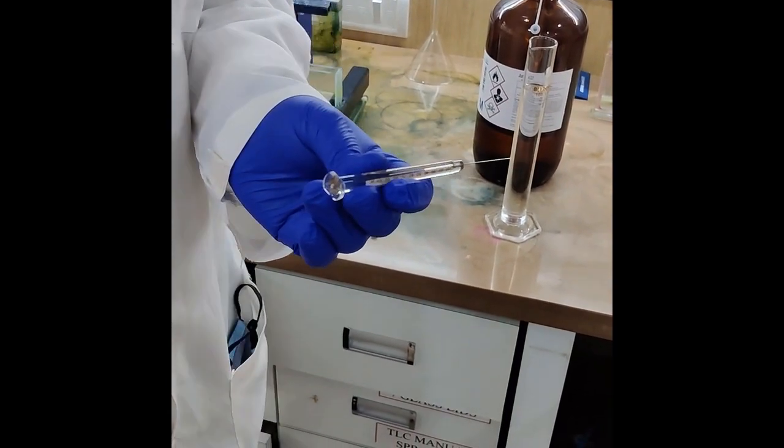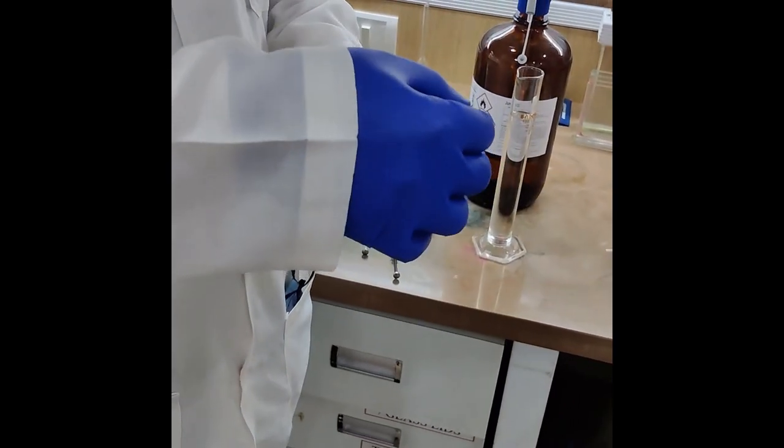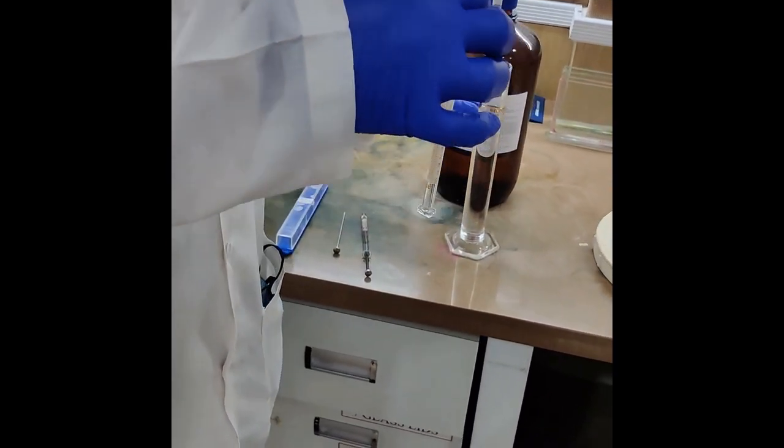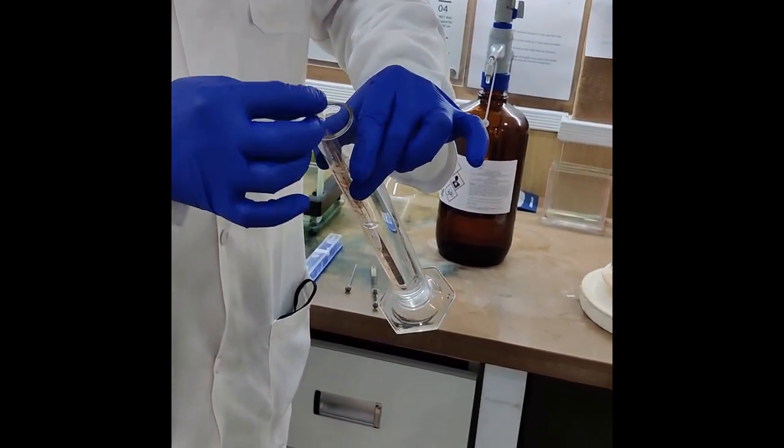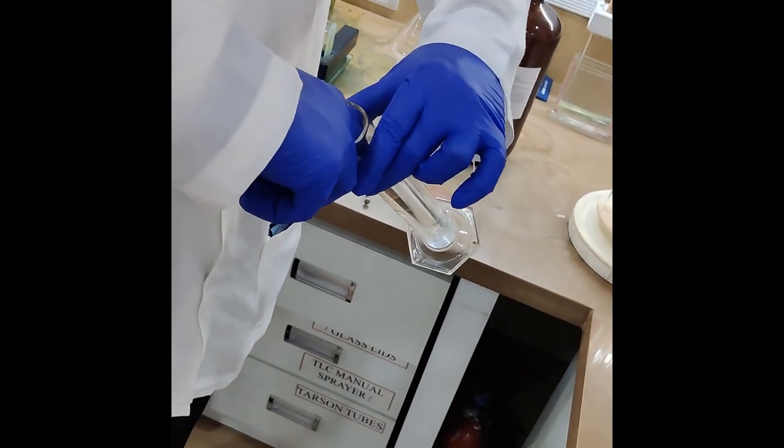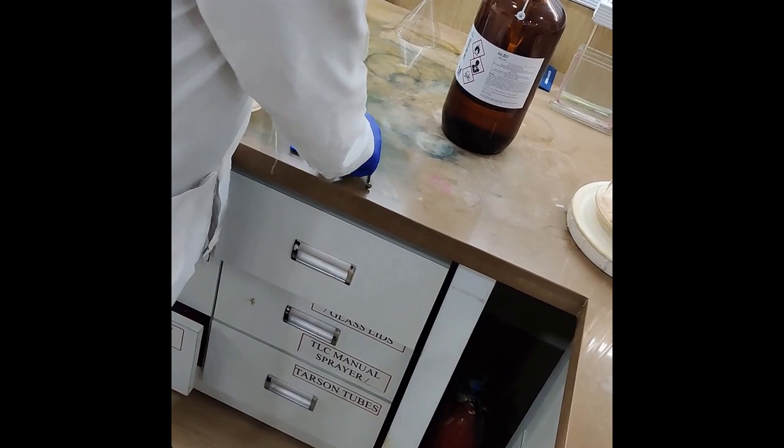Now hold this syringe with the needle tip and carefully tilt the measuring cylinder and place the syringe slowly till it reaches the bottom of the measuring cylinder. Once this is done, also place the piston of the syringe inside the measuring cylinder.